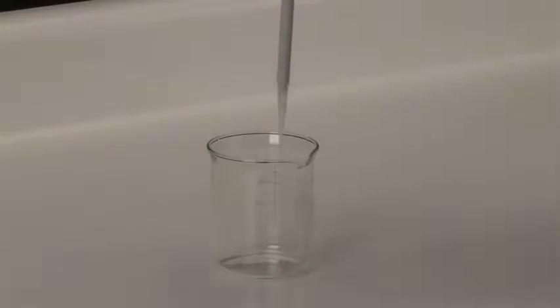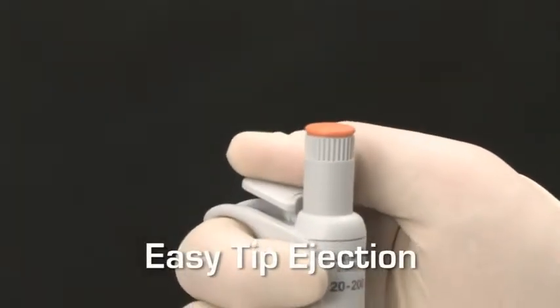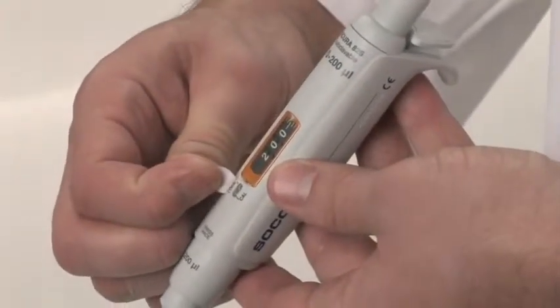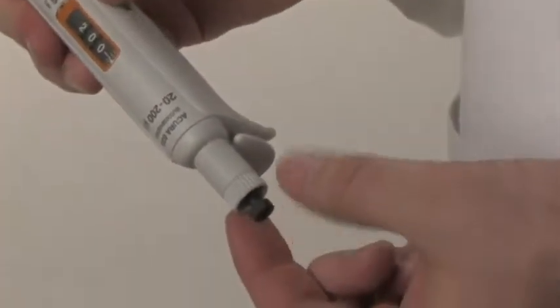The smooth plunger movement enables aspiration and dispensing operations to be performed with minimal effort. Once dispensing is complete, the tip can be easily ejected by pressing the large, soft-padded button. The calibration system enables user-friendly, in-lab calibration. The locking mechanism is protected by a calibration seal sticker, and the system also features an integrated key.